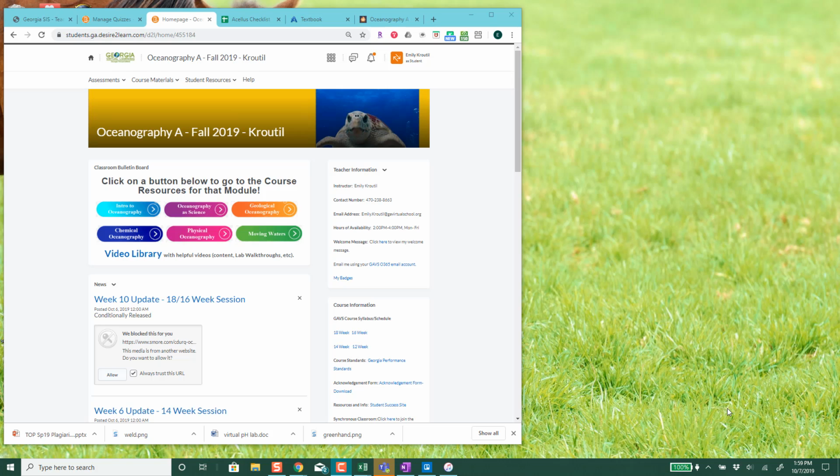Okay, so what I'd like to do today is walk you guys through the DO lab for this class. There's a couple ways to get to this assignment. The first thing you can do is go to course materials, click on content, the chemical oceanography unit, and then click through the pages until you get to the DO lab.